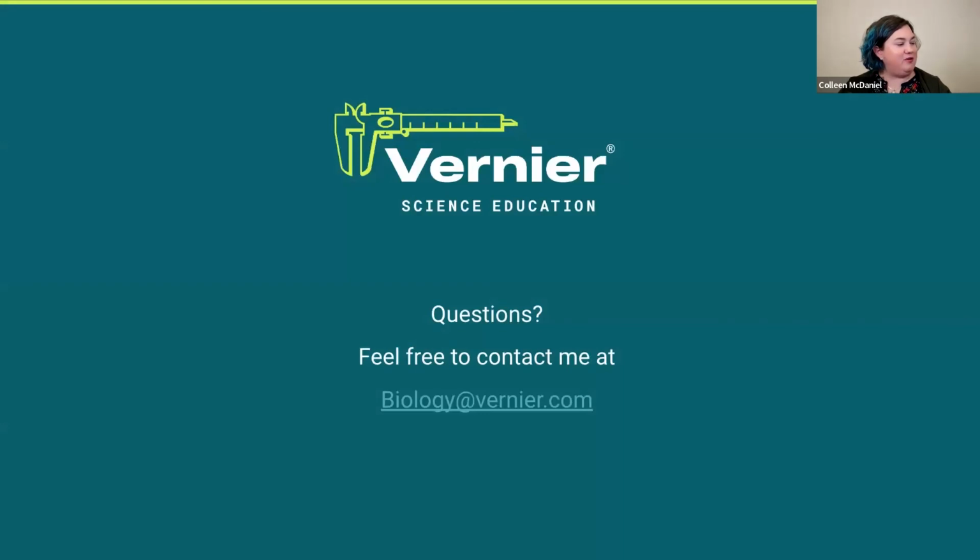Do you still sell the calibration solution for the old DO probes? Yes, we still sell the calibration solution and the filling solution for those probes. So you can always have those present.